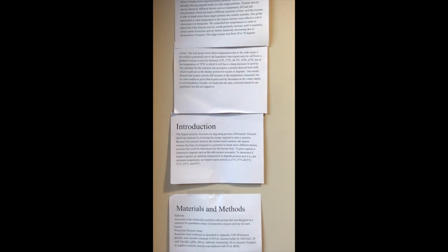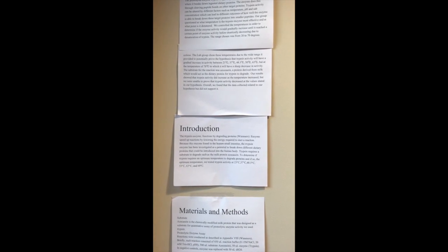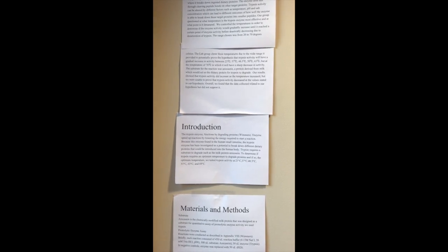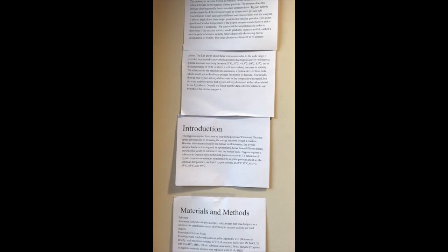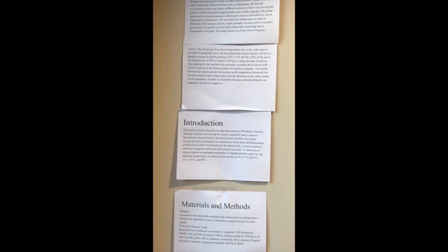Enzymes play an important role in organisms because they can help break down molecules for digestion, increase metabolism, and bind molecules. We are working with the enzyme trypsin. Trypsin cleaves dietary proteins that an organism consumes. Trypsin is found in the small intestine, and it breaks down target dietary proteins by cleaving at their peptide bonds. The trypsin enzyme is usually exposed to a pH of 8.